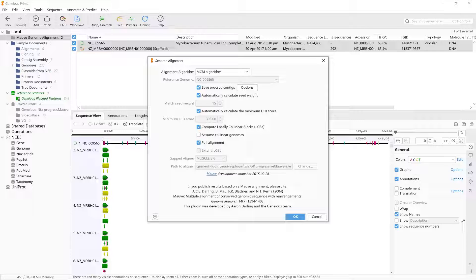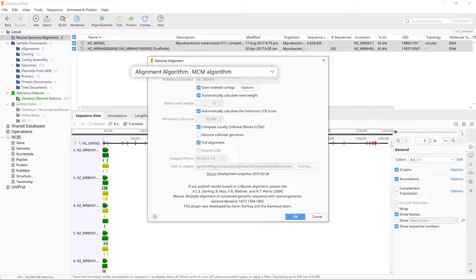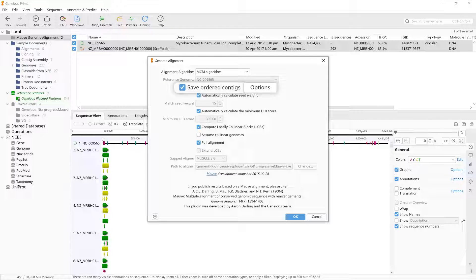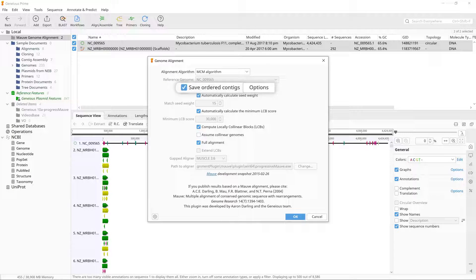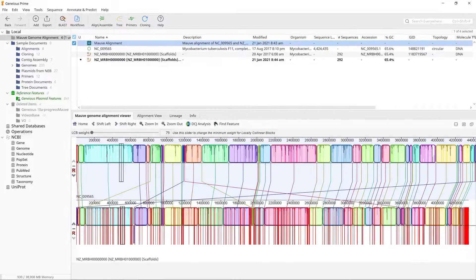In the MOV options change the alignment algorithm to MCM algorithm if it's not already set on this. Make sure the option to save ordered contigs is checked. Leave the other settings at their defaults and click OK to start the analysis.